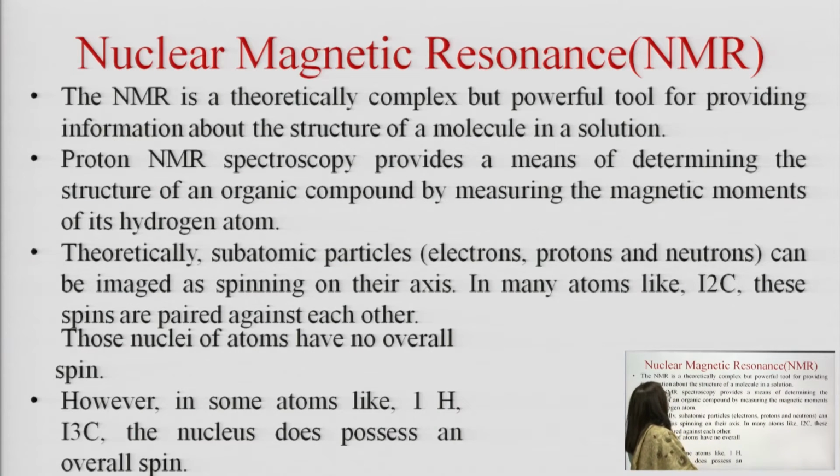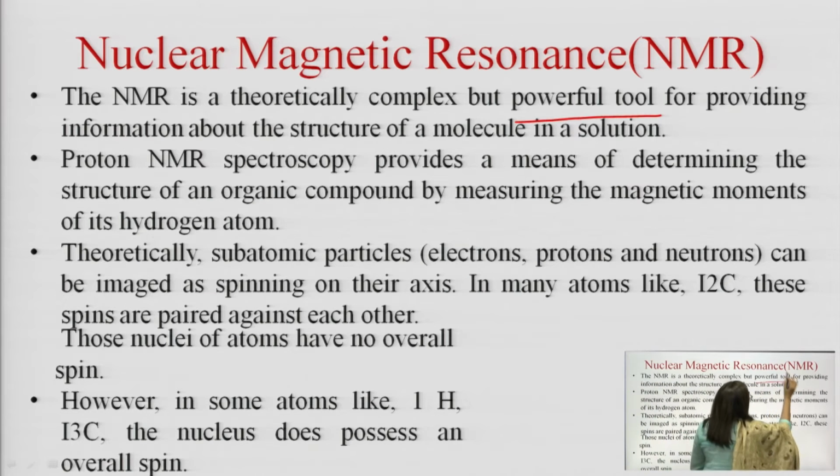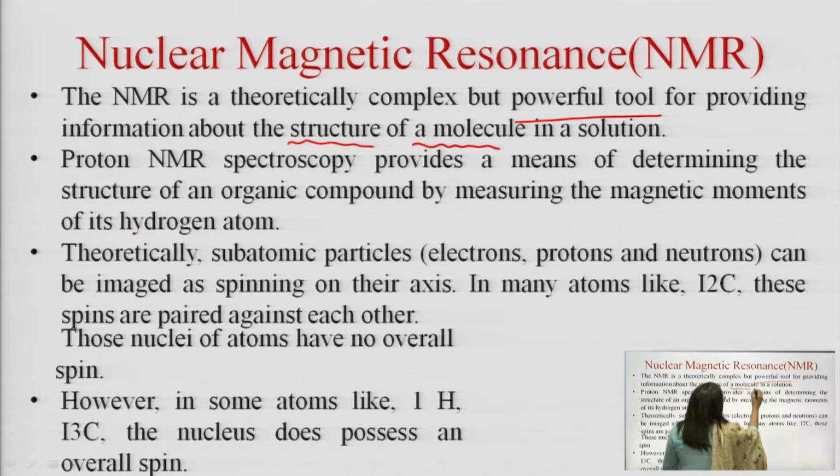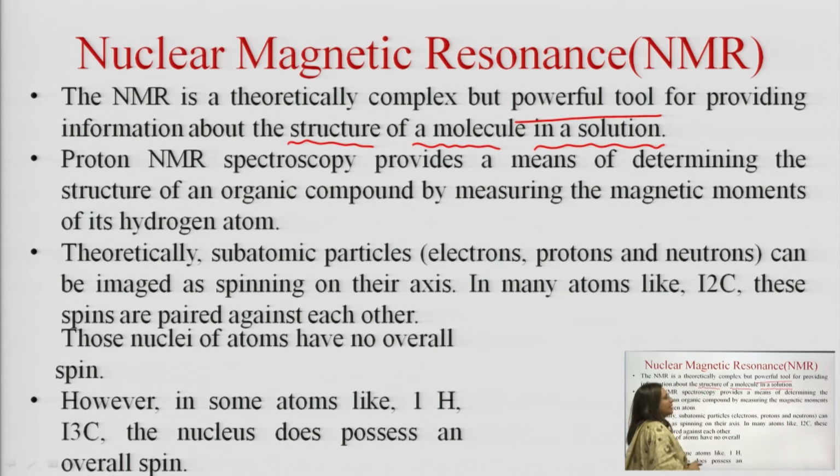NMR is a theoretically complex but powerful tool for providing information about the structure of a molecule in a given solution. That suggests that the analyte is to be dissolved in the solution before exposing it to the magnetic resonance.